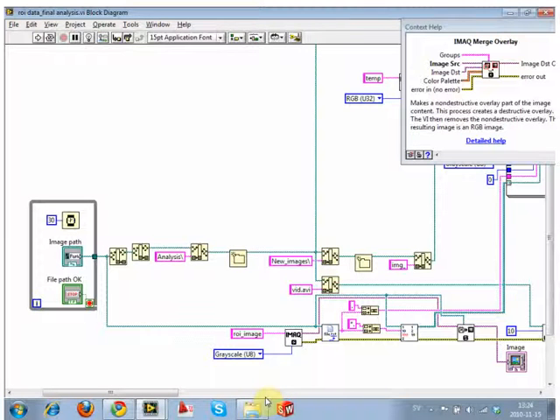Because these are pretty low level VIs, they don't come with help files. They don't come with user directions. They're very low level VIs, and they allow you to make mistakes. So you will make mistakes. You're probably going to come to me multiple times and say, look, I'm making this file and I don't know where it's going. And it'll be saving it somewhere really strange. But we'll figure it out.